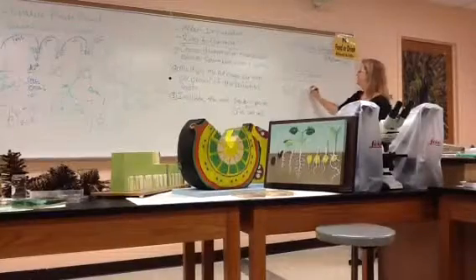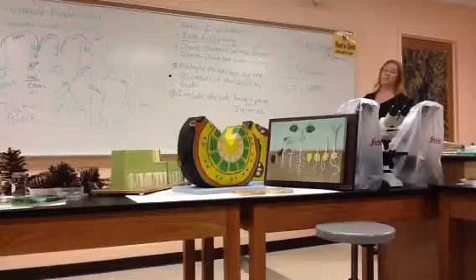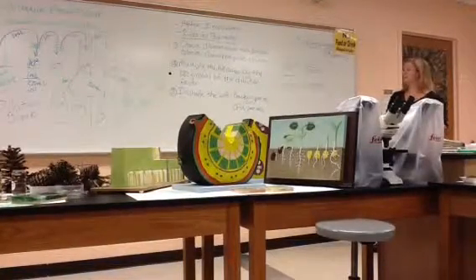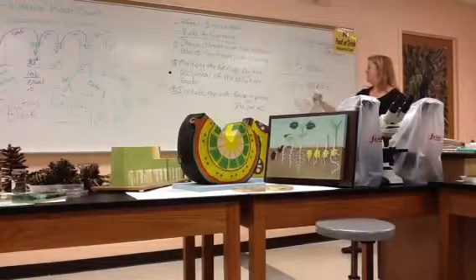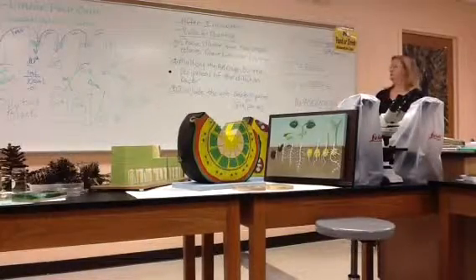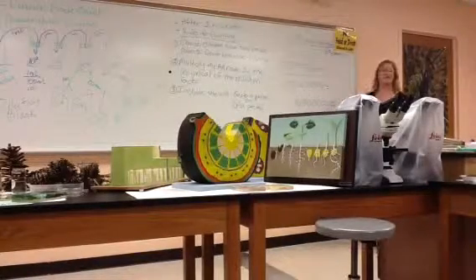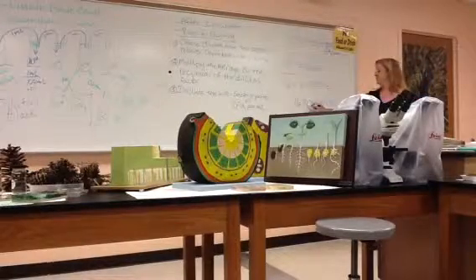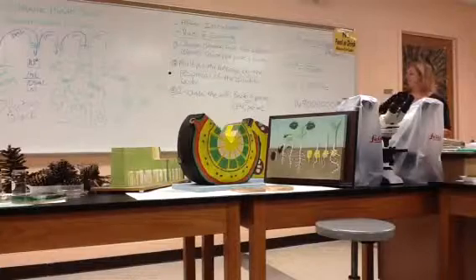167 times the reciprocal. And anything divided by 1 is itself, so you can just leave that off. And the answer, you don't even need a calculator. You just add the 6 zeros to the end. It's 1 times 167 is 167, and then all of the zeros get tacked on. So you have 167 million bacteria.